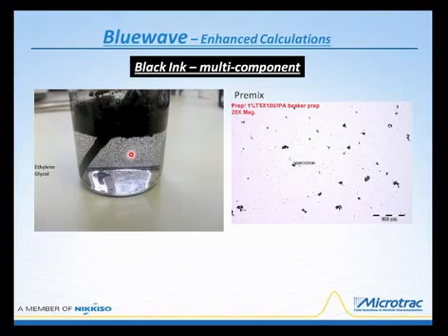And if we were to put this into an instrument, it would cause the optical system, at least the cell, to become dirty, and then it would have to be removed and cleaned and those types of things. So this is a valuable first step anytime you're going to be dealing with any type of unknown. Well, this is the material.